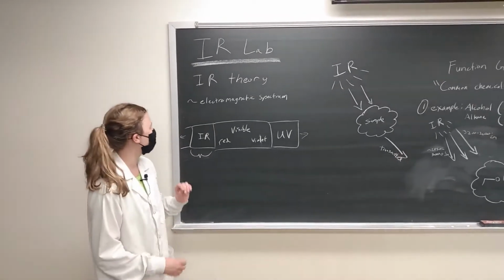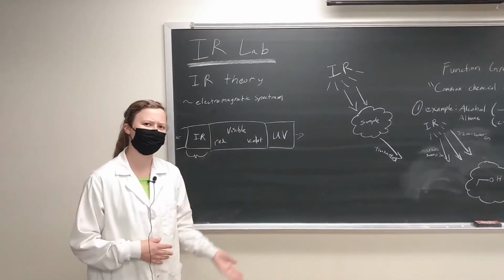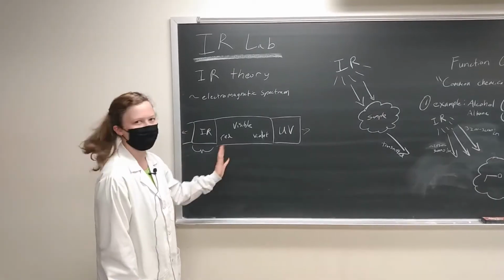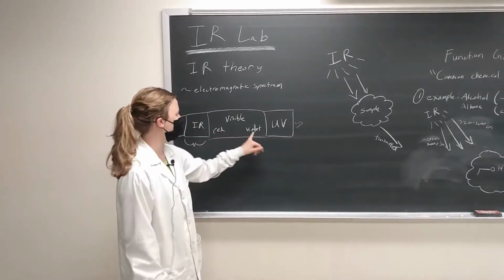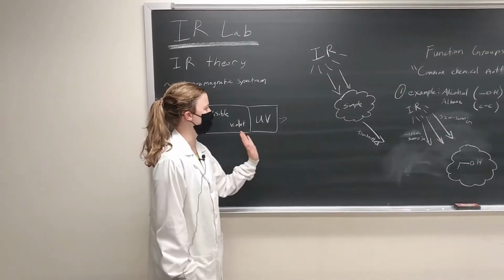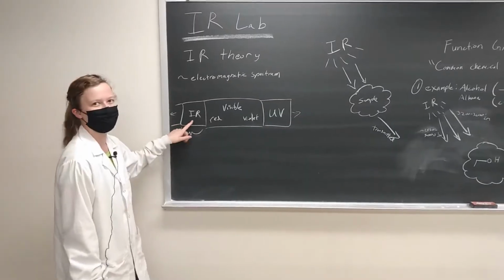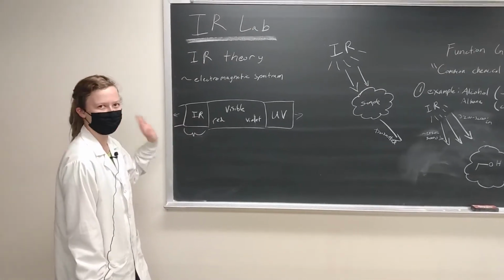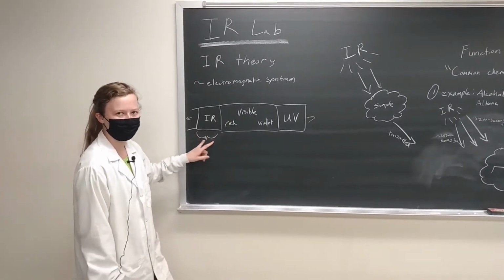All right? So we're going to begin talking about IR theory by looking at the electromagnetic spectrum, which I'm sure you guys are all familiar with from general chemistry, other courses you've taken, maybe in physics. But the electromagnetic spectrum is just the way that we measure light or radiation, right? So there's a certain wavelength of light that we can see, from red to violet all the way through, and then at one end of the spectrum, higher energy light, we have ultraviolet, and then eventually we have X-rays, gamma rays, and things down there. And at the other end, if we redshift the light, go lower energy, we have IR, or the infrared spectrum. And then if we keep going down this way, we get microwave and a bunch of other things. But right here, this area, IR radiation, that's what we're going to be using to identify some of our organic molecules.